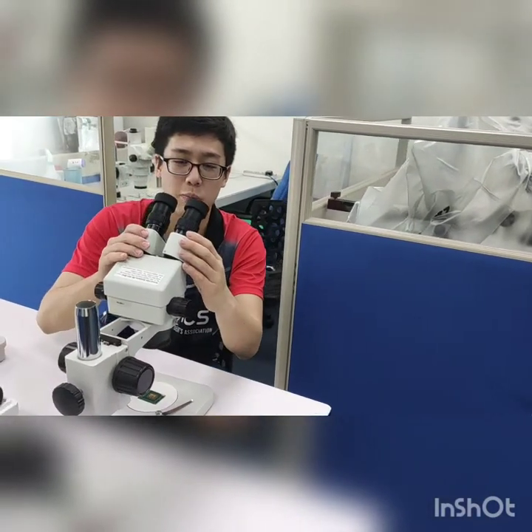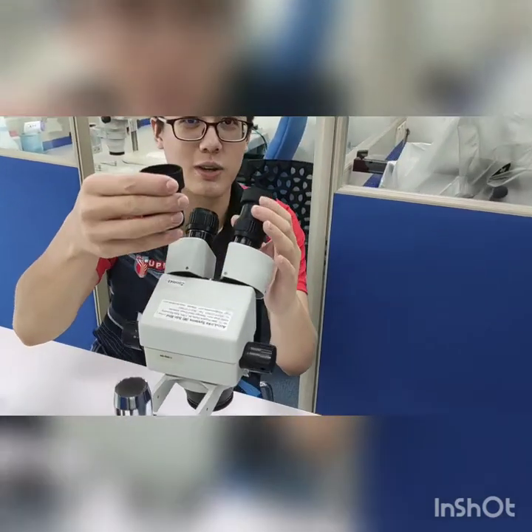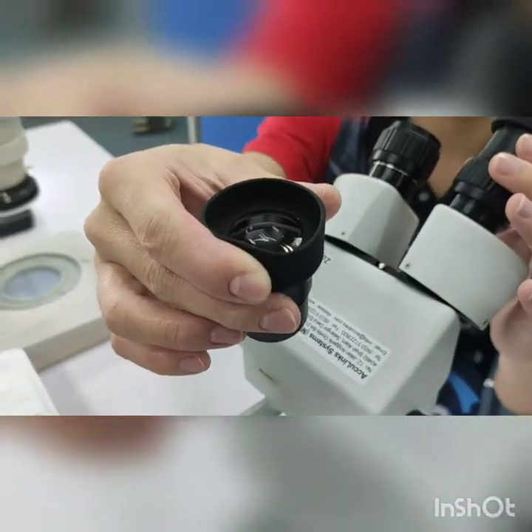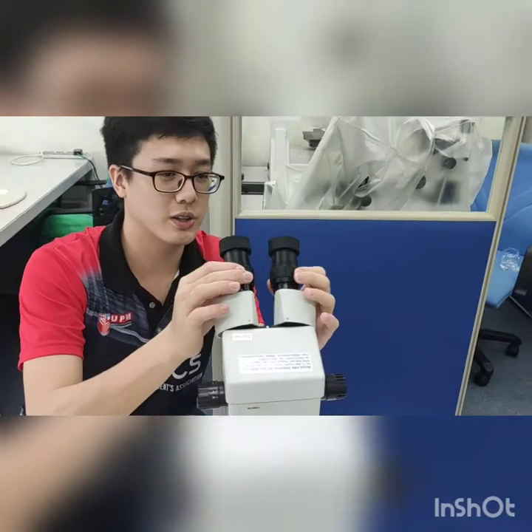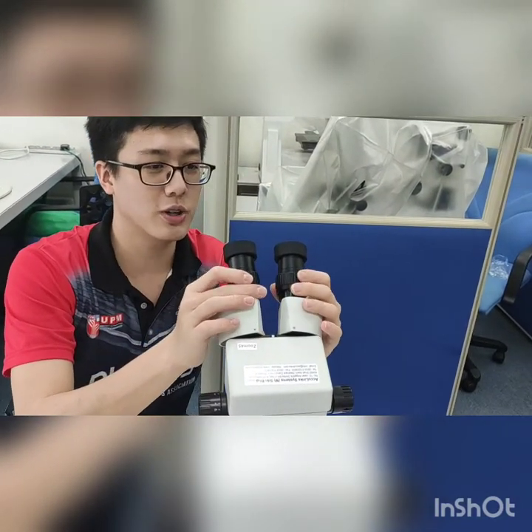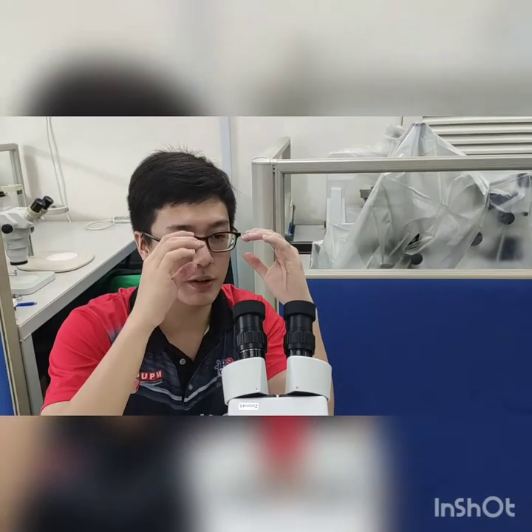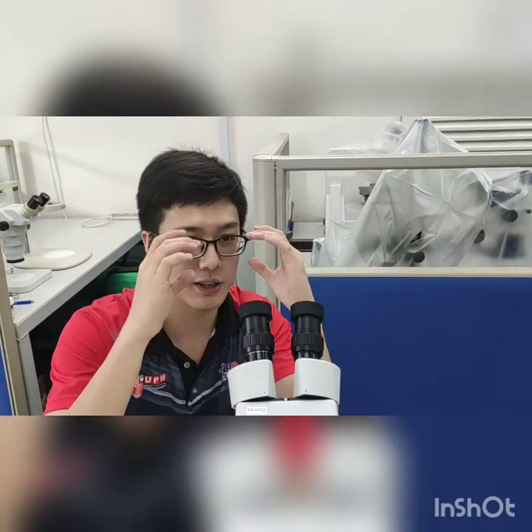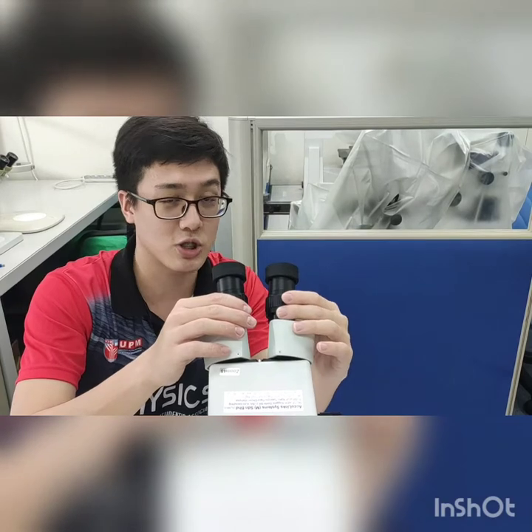This top part here is the eyepiece. You can install the eyepiece here, and then here, you can turn to adjust the diopter of the eyepiece. The importance of being able to adjust is to suit the vision of both our eyes, because our eyes have slightly different power, so it can affect the image, maybe making it a little blurry. So we can adjust it so that the image is more sharp.